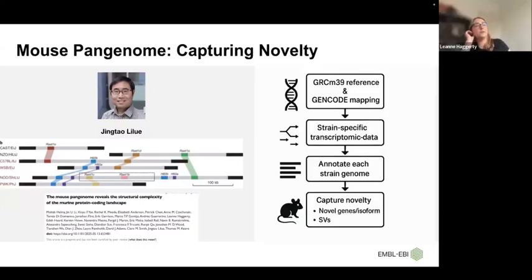Yeah, it's just from my point of view, what I was saying about how you could have these areas on the pangenome graph that you know are collapsed, where everything is the same in this region and it's very well conserved. It gives you an indicator that there's not much else I need to do here. So this is from a very annotation point of view. Whereas in the parts of the graph where you've got a lot of variation and an indicator of a lot of structural variation, you would need to use different methods to target how you do the annotation there.